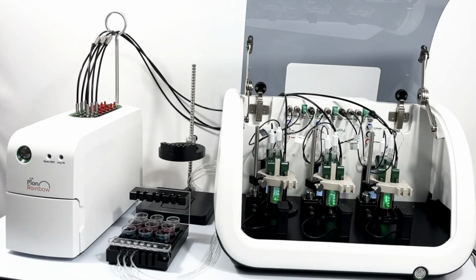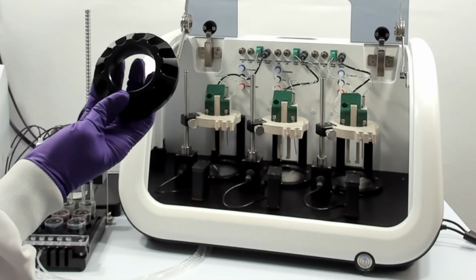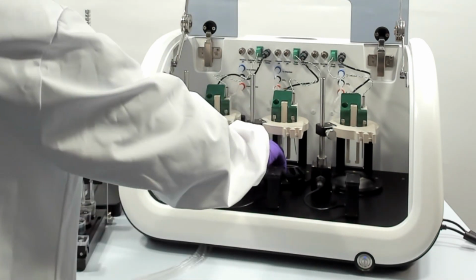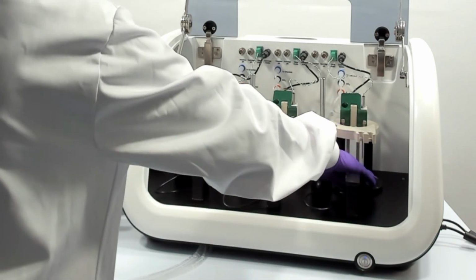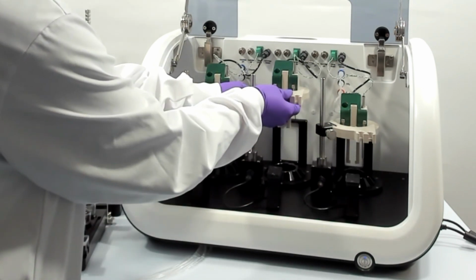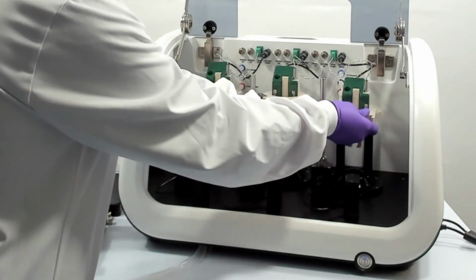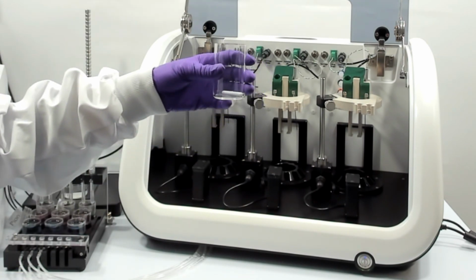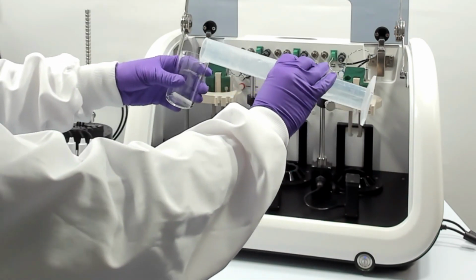And here we can see the external rack where our flow-through vials head to, and this is where we would take our samples, or this would normally go to an external robot for auto-sampling as well. This is our locating ring, which we sit in just before we put our 60 ml chambers in place. This allows for proper heat conduction for our smaller chamber sizes. We're then going to fill our chambers with the 60 milliliters of the bicarbonate buffer, as well as a stirrer bar which comes with the chamber as well, to allow proper homogeneous environment inside that chamber.